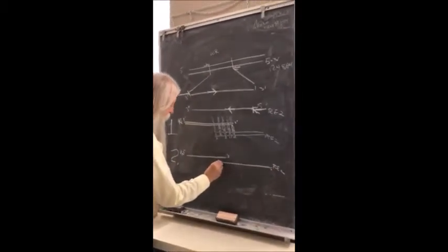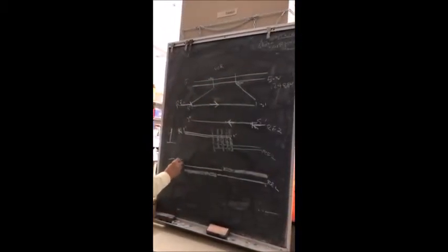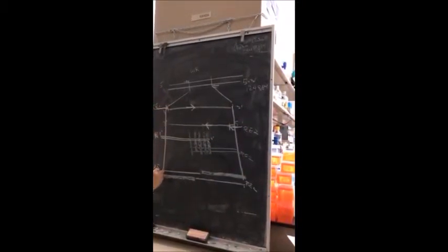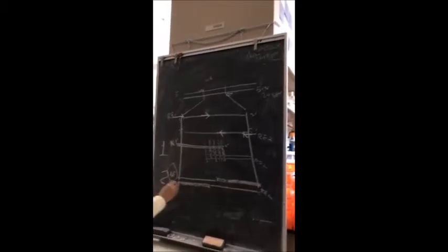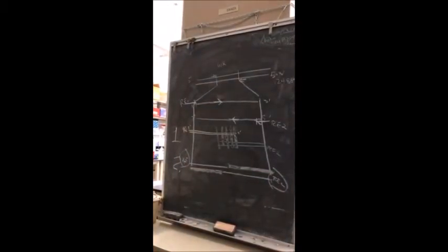So when this fills in, you're going to generate a fragment that goes from the 5' end to the 3' end of WR, with 2 different restriction enzyme sites on it.